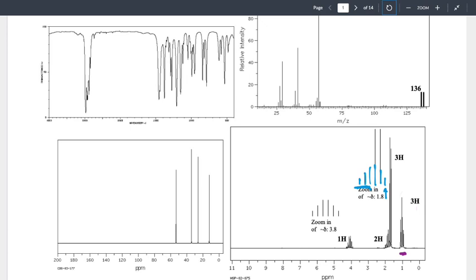Why is that important for us? We know the identity of the next atom then. It must be a carbon. And I know that carbon must have 1 hydrogen connected to it. I want to continue to show my hanging bonds. That new carbon is not being addressed within this line. Okay? I'm guessing at it effectively based off of the data of my multiplicity. Kind of, sort of? Okay.